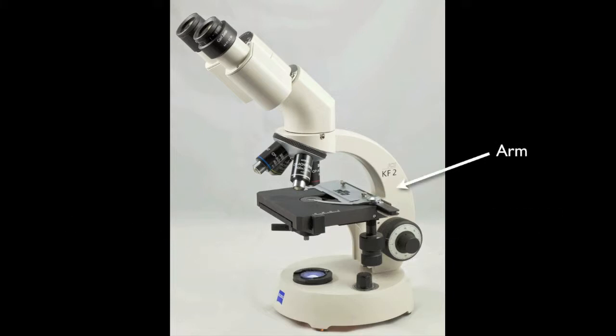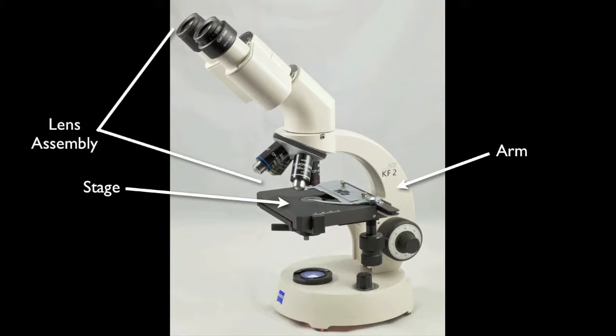The arm is attached to the base, and besides being where you grasp the microscope when carrying it, the arm holds the two major sub-assemblies of the microscope. The stage, where specimens are placed for viewing, and the lens assembly. Let's examine these two sub-assemblies in greater detail.